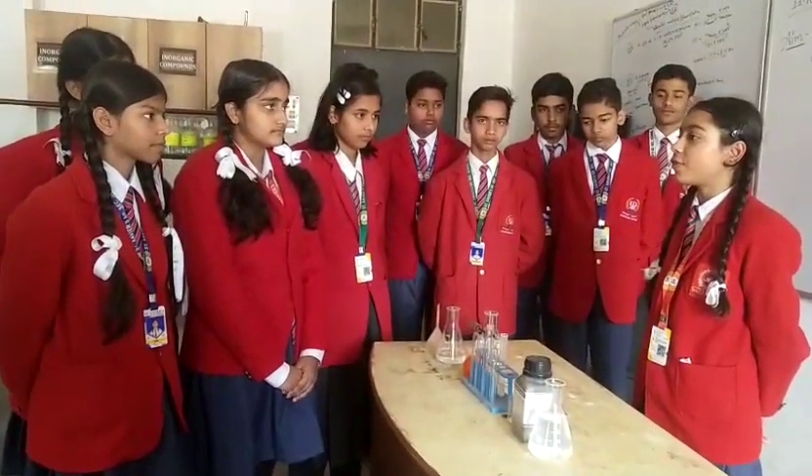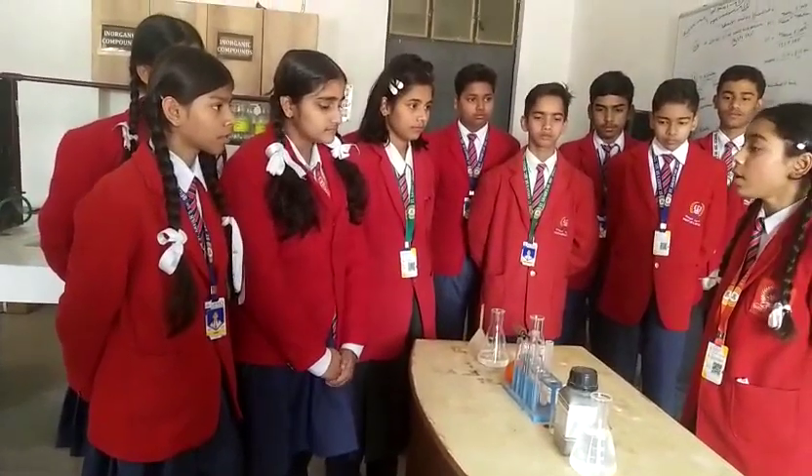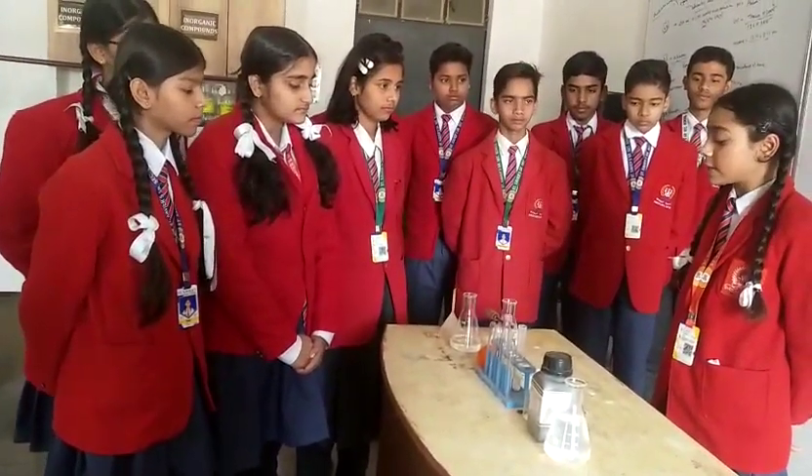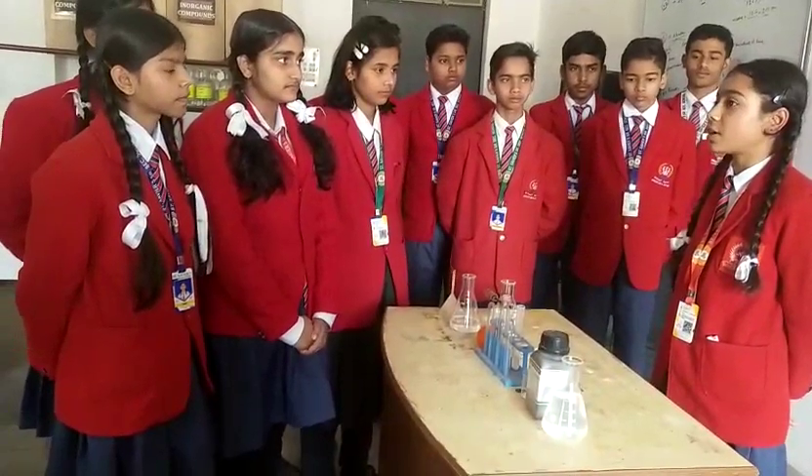Hello everyone, my name is Sarapita from class 8A, a student of French English Senior Secondary School. Here I will be doing a science experiment in front of you all, which shows the oxidation reduction reaction.